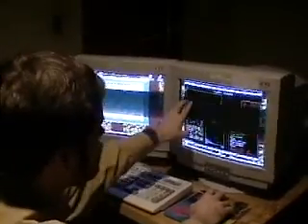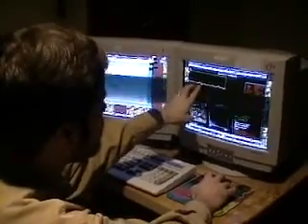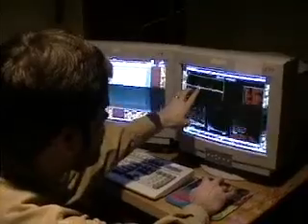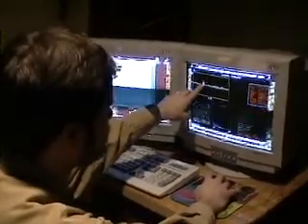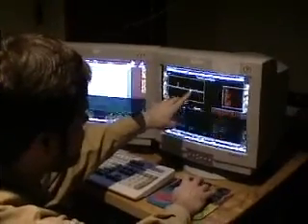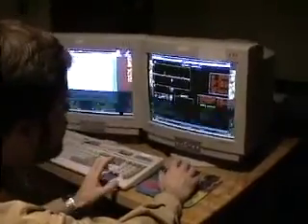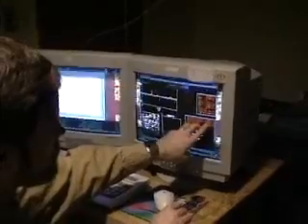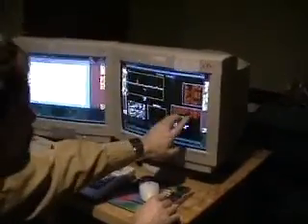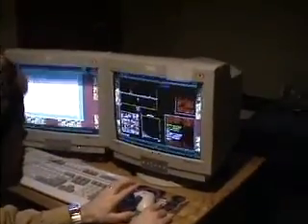Once you draw the cross-section, it brings up this graph here, and there are two markers. I can click and let go on one of them, and now I can move this around and, let's say, position it to the top of a peak, and then I can click and let go on the other one and move it to the bottom of that peak, and then click again to release it. And then over in this window, it tells me the horizontal distance between those two, 39 nanometers, the vertical distance, 15 nanometers, and the angle, 21 degrees, between those two.